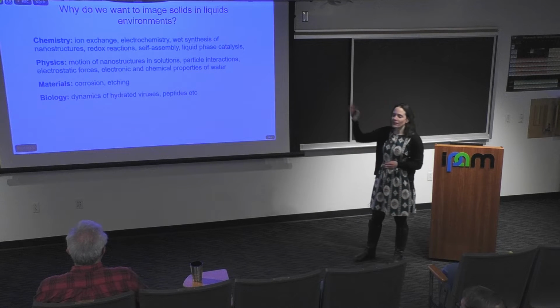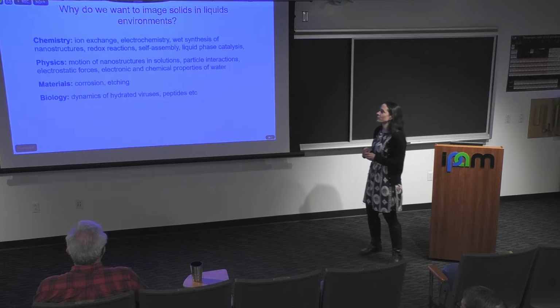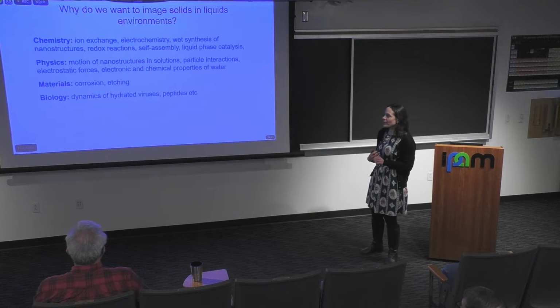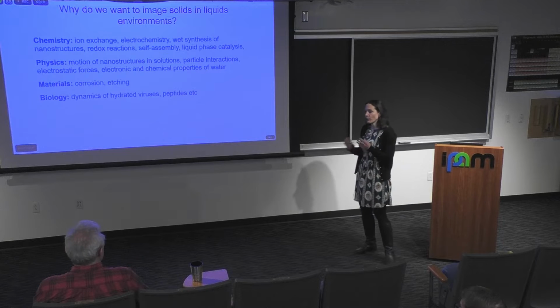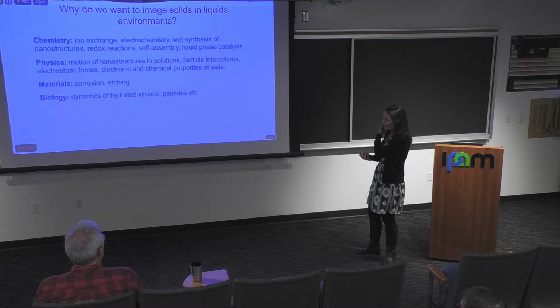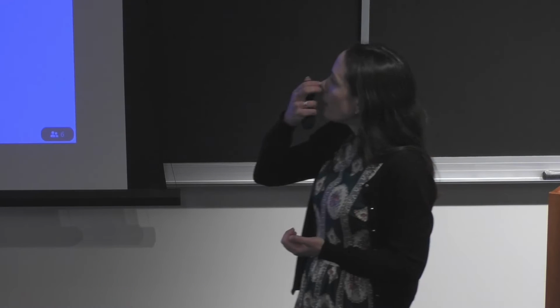So that could be chemistry, the ion exchange I've already talked about. We're also interested in investigating electrochemical reactions, wet synthesis of nanostructures, which I'm going to talk about a bit at the end of the talk. Lots of things in physics, and a lot of our colleagues in the National Graphene Institute are focused on understanding the fundamentals of fluid flow through confined spaces, which again I'll come on to later. Again, in materials and biology, lots of things happen in liquid. Very little interesting stuff happens in perfect vacuum, with the exception perhaps of quantum computers, so sorry.